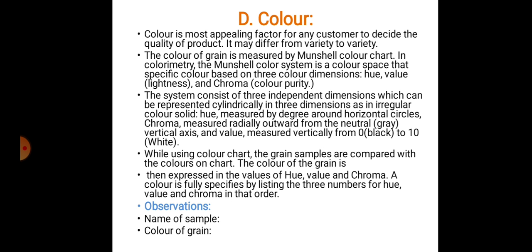Color is the most appealing factor for any customer to decide the quality of a product. It may differ from variety to variety. The color of grain is measured by the Munsell color chart.